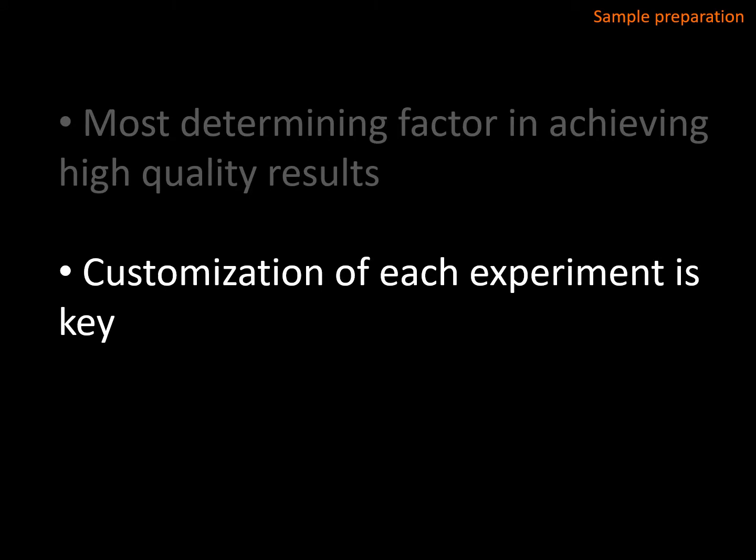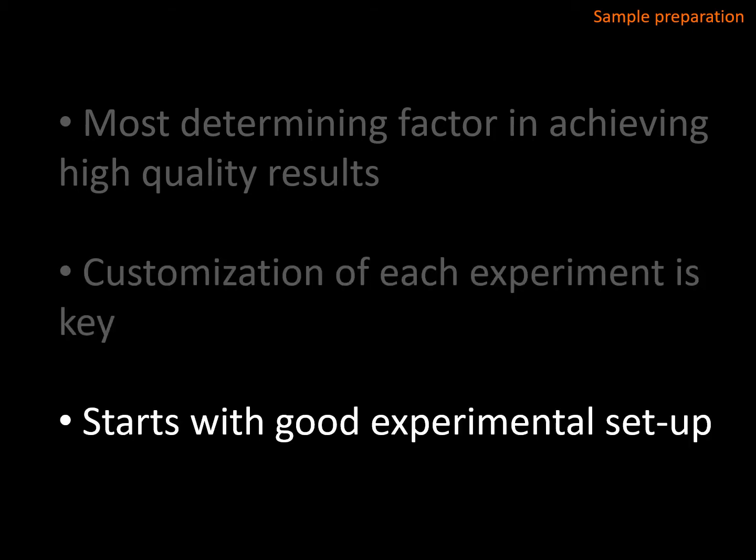For this, customization of each experiment is key because it involves a huge amount of different steps and processes that you have to carry out in order to enable the labeling and detection of your target of interest. And of course, as any other good experiment, it starts with a good experimental setup.